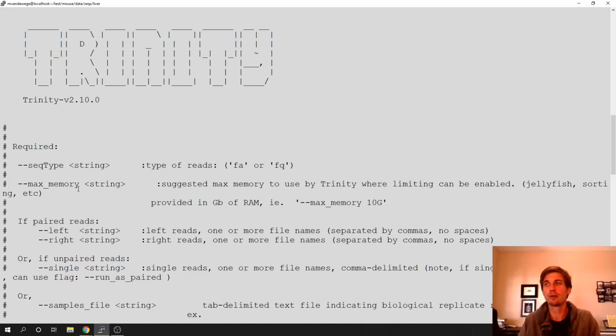Early in this semester, I wanted you all to do a full genome assembly on something small like E. coli, but we kind of ran out of time. So I'm killing two birds with one stone, both the concept of assembly and using assembly techniques to reconstruct all of the genes that are expressed from a tissue.